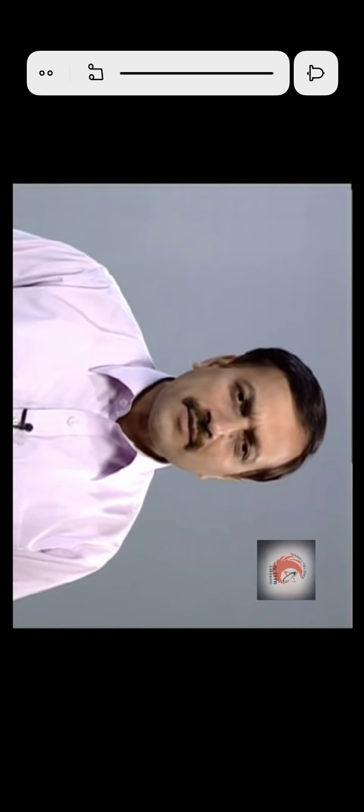Hello everybody and welcome once again to this series of laboratory measurement in public health engineering. In today's program, we will talk about hardness and its measurement in water.